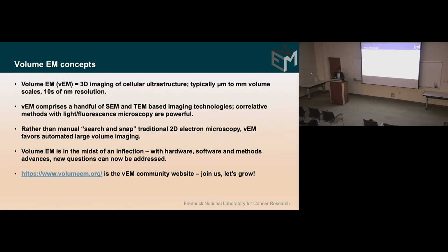So volume EM is, as I mentioned, the 3D imaging of cellular ultrastructure at microns to millimeter volume scales at tens of nanometers of resolution. It's a handful of approaches that complement each other and have favorite spots where they work really, really well.